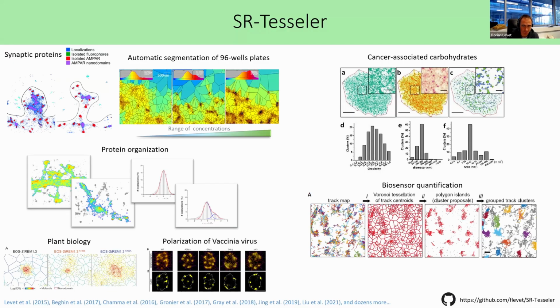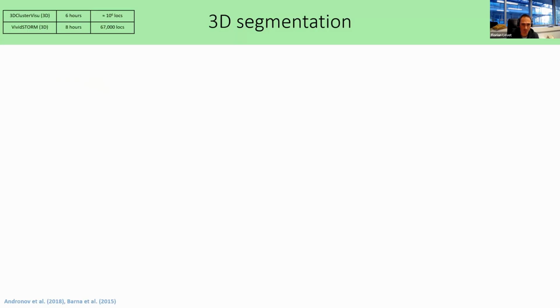biological models. So this is mostly 2D at that time, but at some point we begin to be interested in trying to do that in 3D also. And so when we started to work on that was around, I think 2016, 2018.